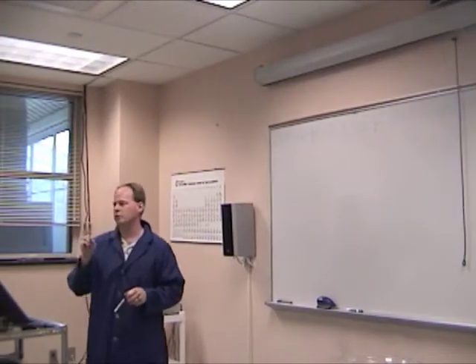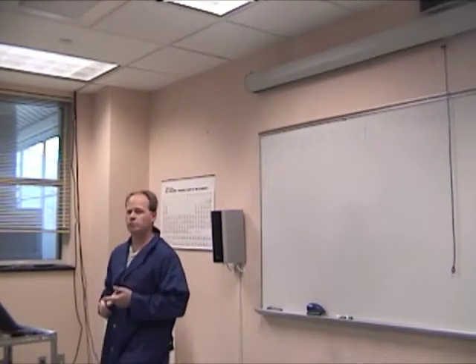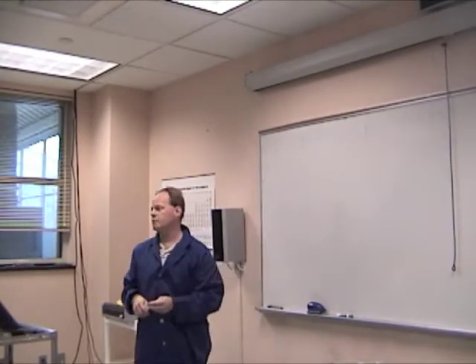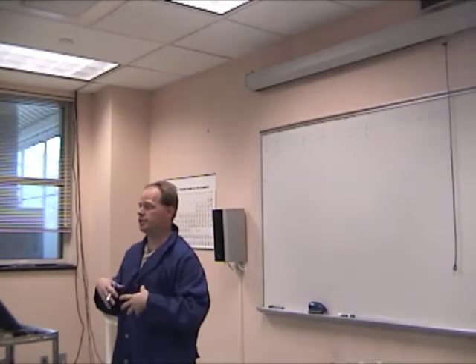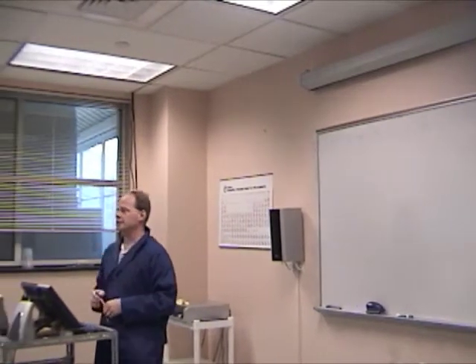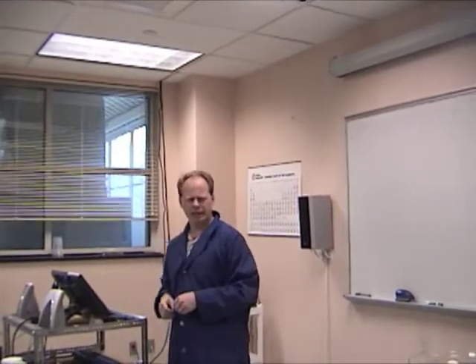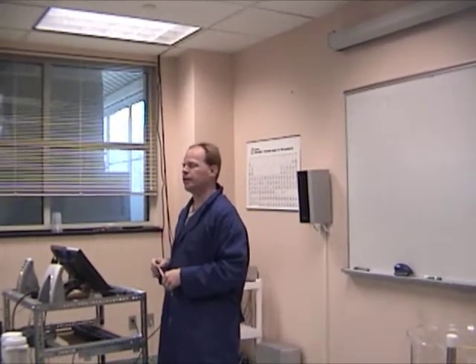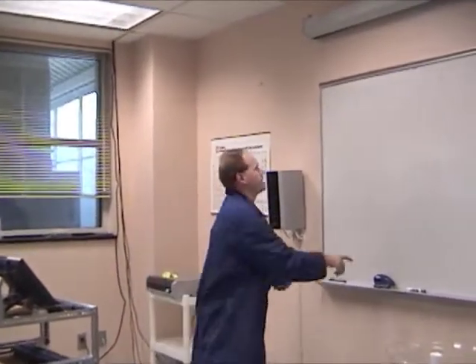We're going to talk about three things today. First, we're going to talk about making biodiesel, making a small batch. I'm going to talk about some of the basic chemistry. We're actually going to demonstrate a batch, and they're going to teach you how to do a real titration using a titration kit. And then we're going to make a batch of biodiesel from waste oil. And hopefully by the end of today, we'll have this batch sitting over here separated so that you can see it. Okay? A little bit about basic chemistry.